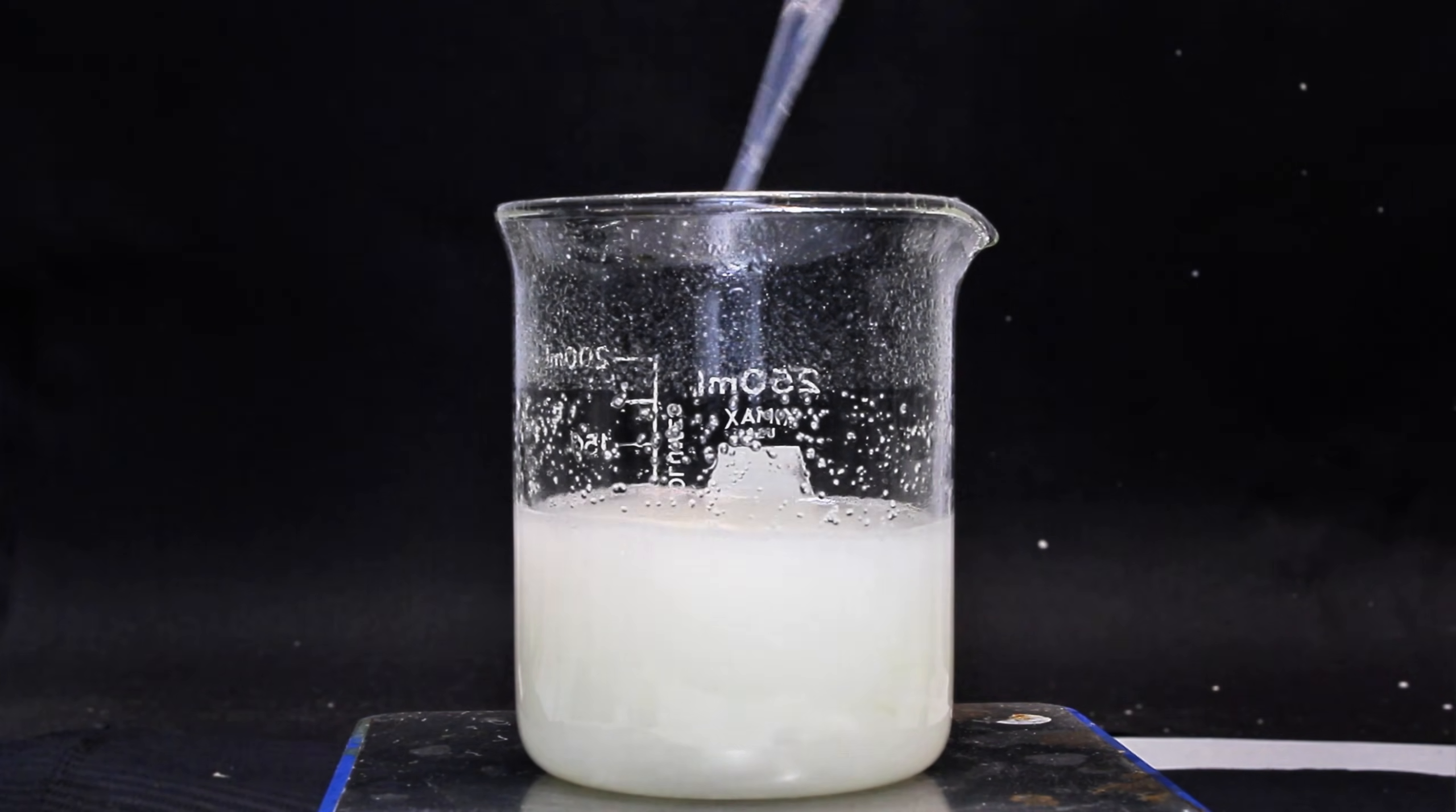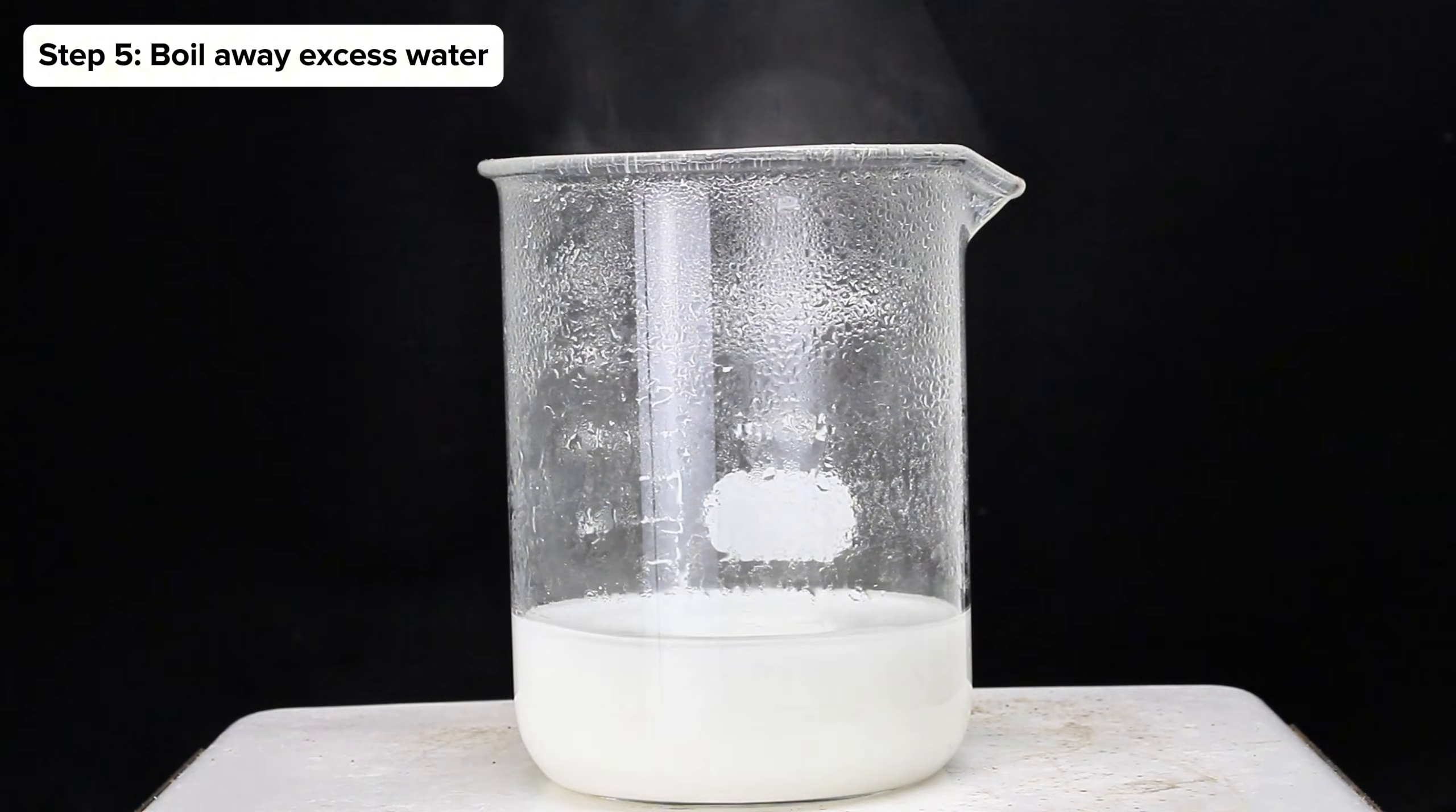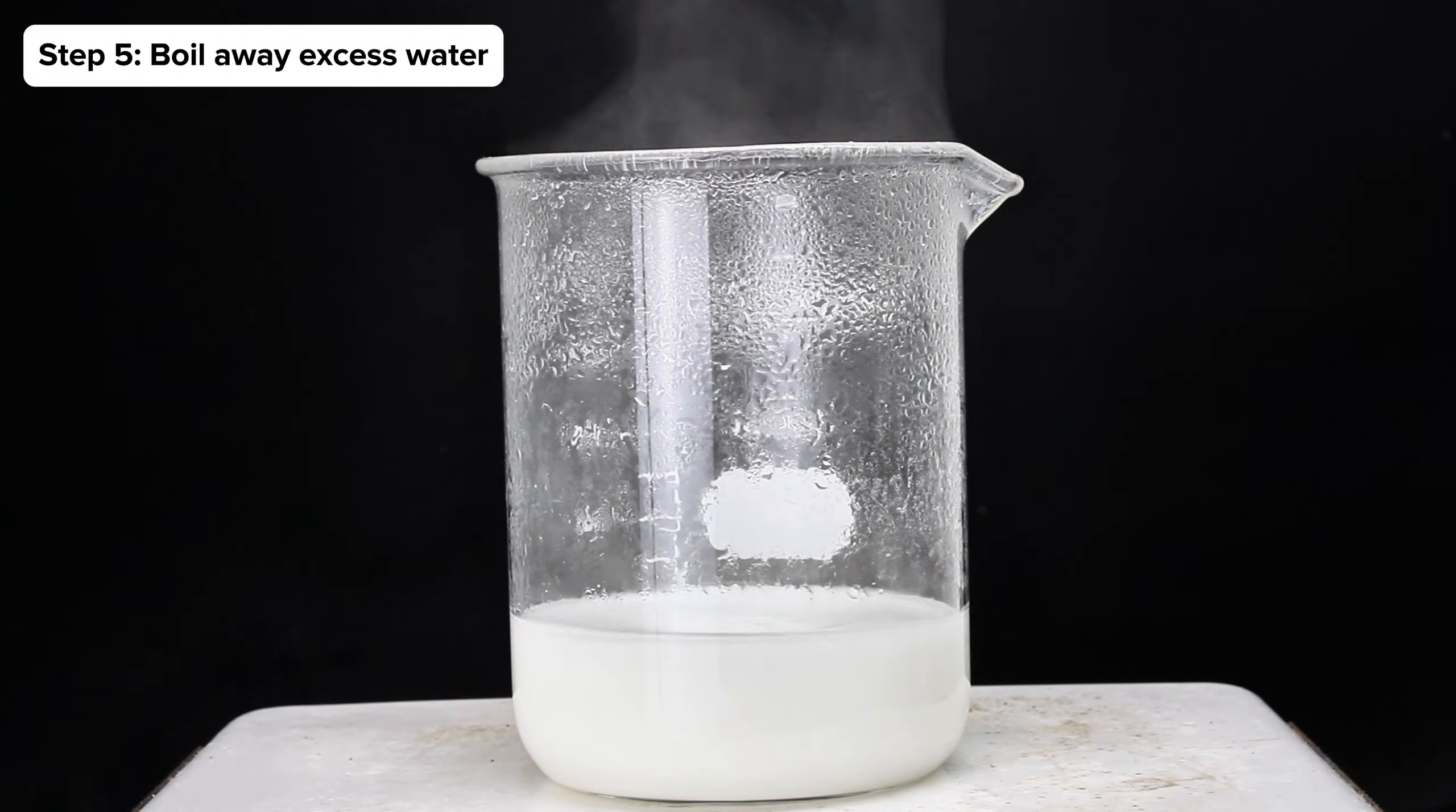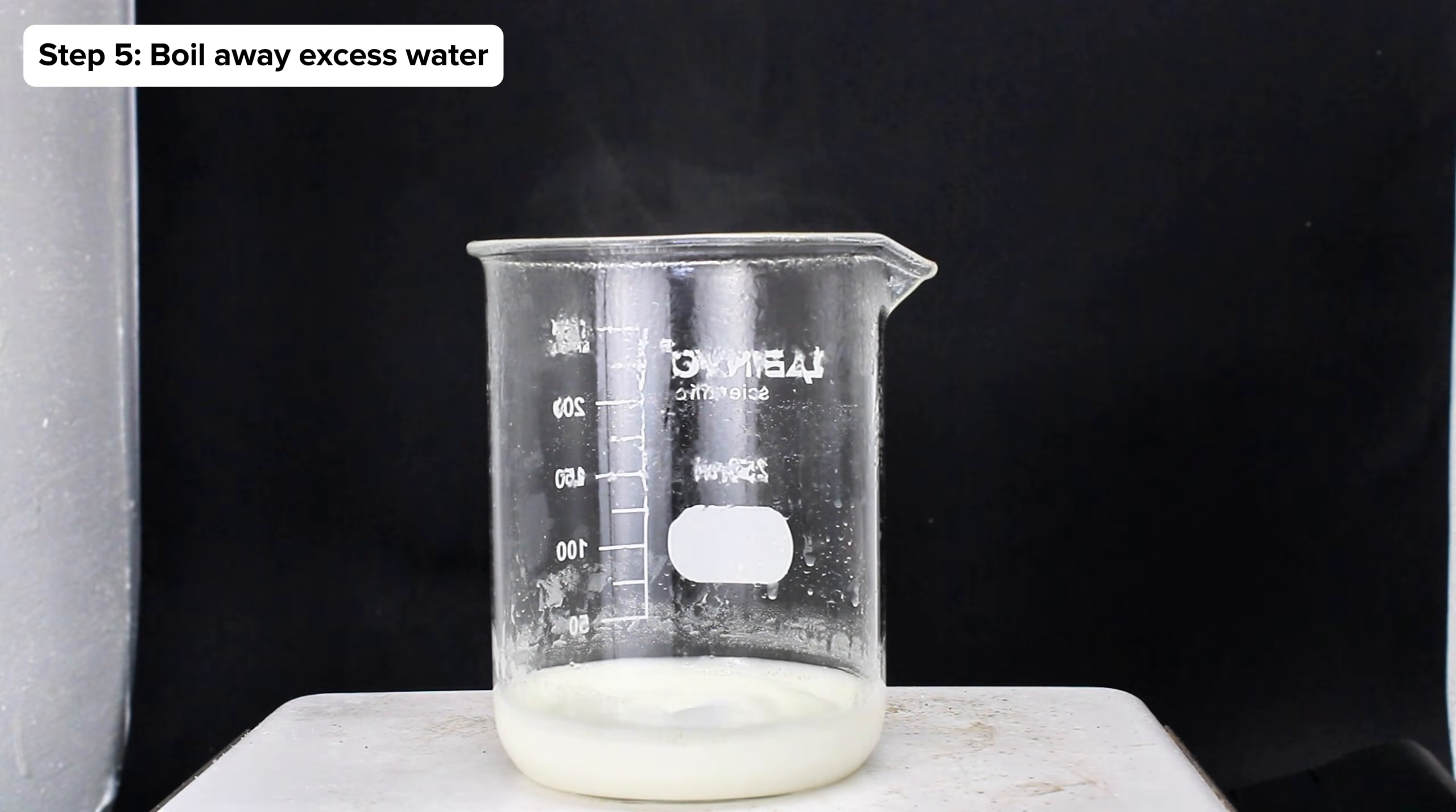Once the mixture stopped bubbling, I continued to add nitric acid until the pH was around 3. I then heated the mixture under constant stirring for a few hours to drive off all the excess water and continue reacting the elements to their respective nitrates.